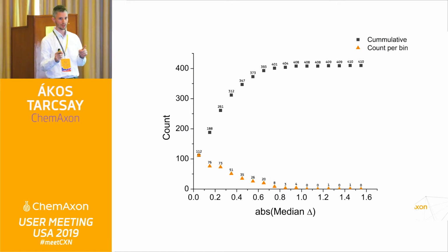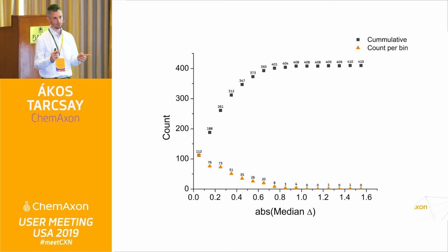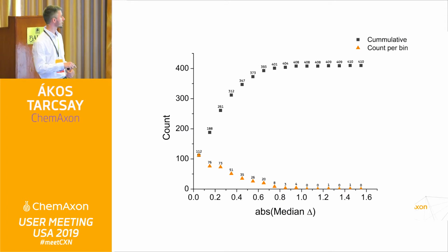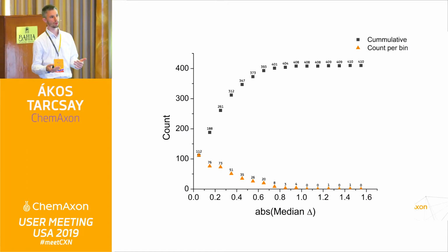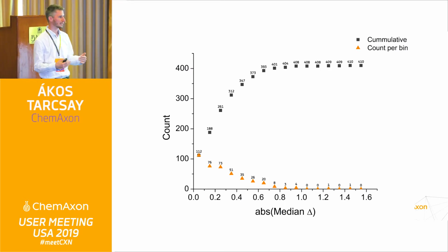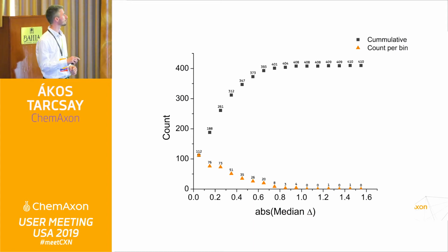Since it can be in both directions, one can be positive, the other can be negative, so here we use the absolute values. So what's the change? Let's say that if it is higher than 0.3, which is on the pActivity scale, 0.3 was selected as being the meaningful change. So as you can see, these are the ones that might make sense.